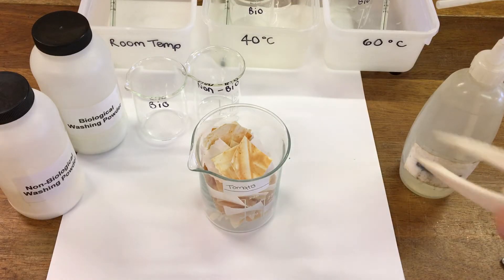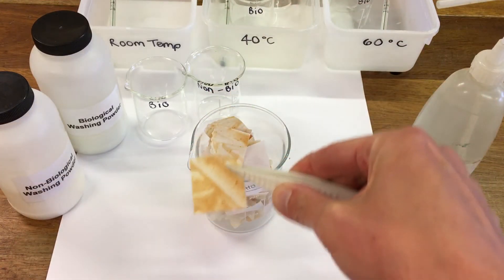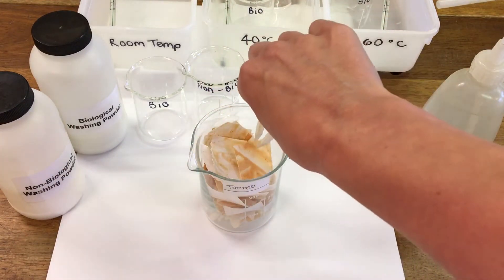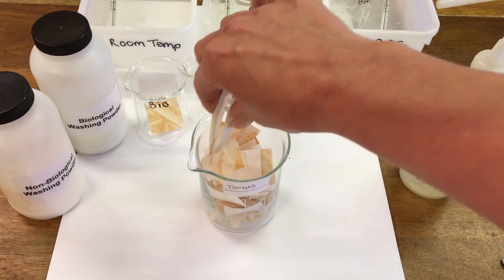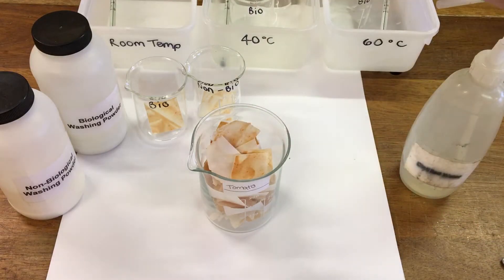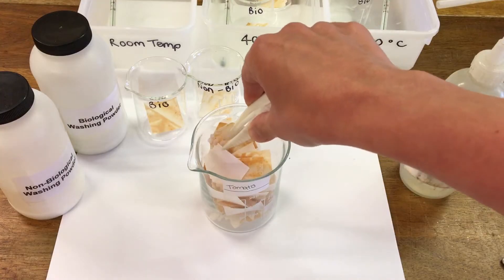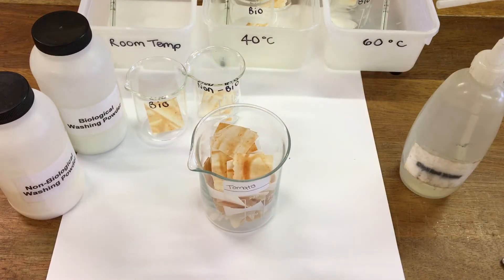I've got some cloth here which has been stained with tomatoes, so you can see the cloth stains here. I'm going to pop a piece of cloth into each of our beakers, and we're going to test how the different washing powders work at different temperatures.